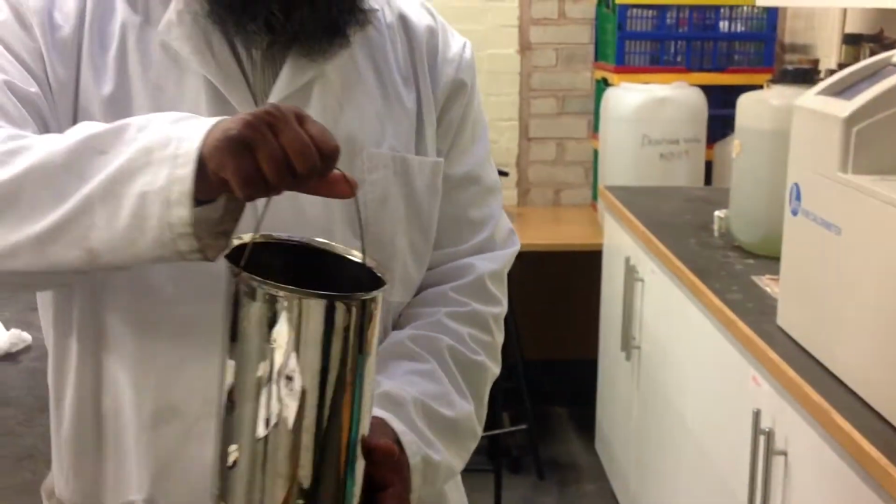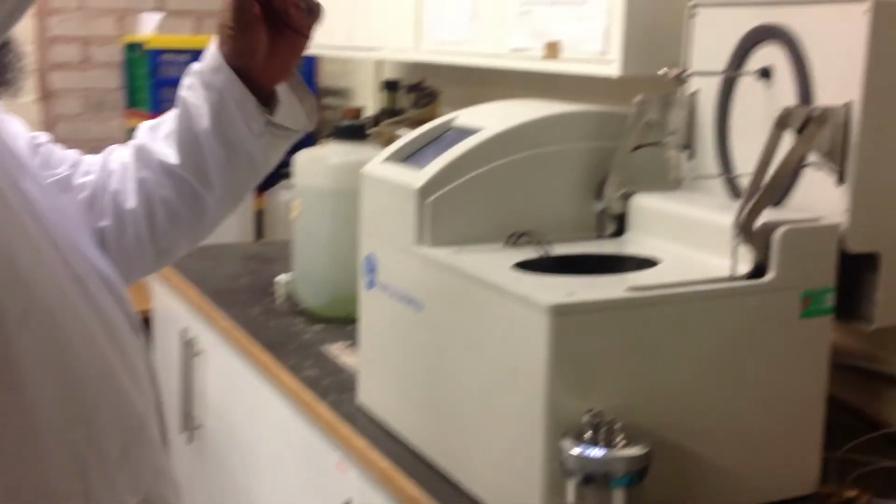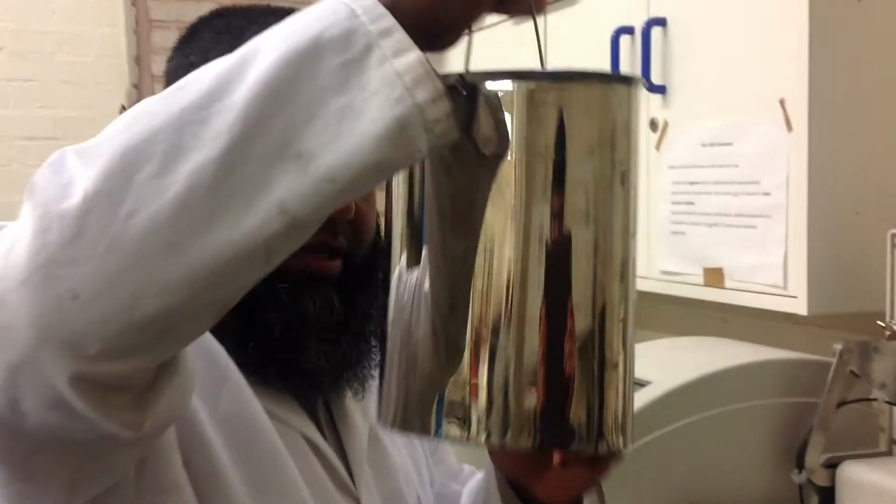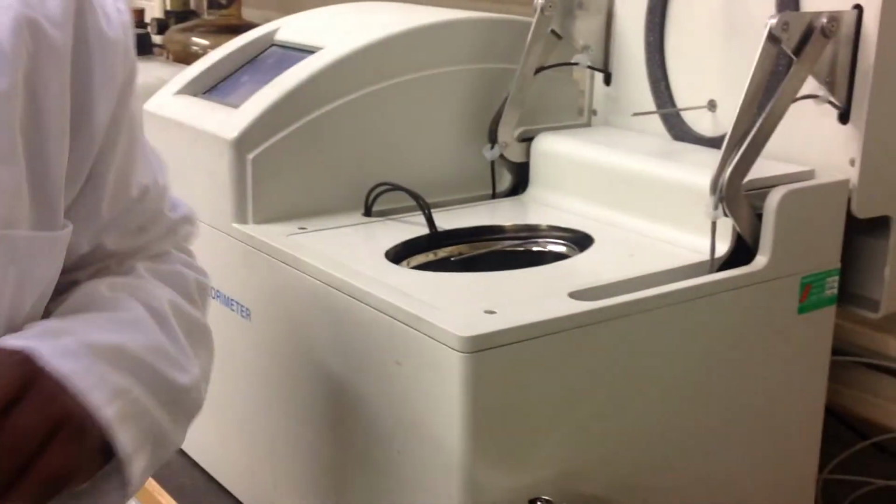This bucket with 2 kilograms of water goes inside this machine, but we have to check the slot at the bottom. So make sure you're checking the slots, and then I'm just placing this bucket inside according to the slot position.